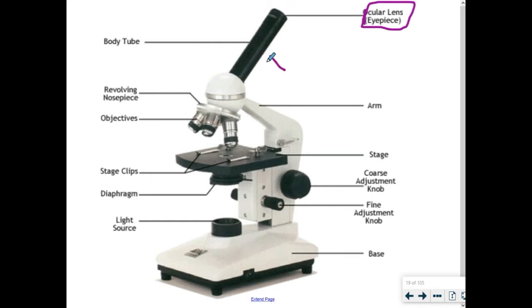And somewhere inside this tube, there is a piece of glass, a lens, and it probably multiplies everything 10 times in terms of its zoom. It lets you zoom in 10 times. That's what's traditional. It might not be 10, but it probably is. That's one lens we have. But that's not the only lens we have. These are often known as compound microscopes because you get these little rotating objective lenses right here. And I wish they'd have written on this particular slide, this is the objective lenses, because there's 3 of them. And you rotate and click them in depending on which one you want to use.